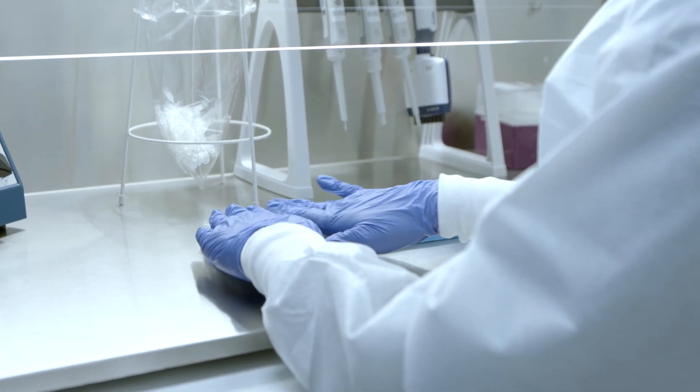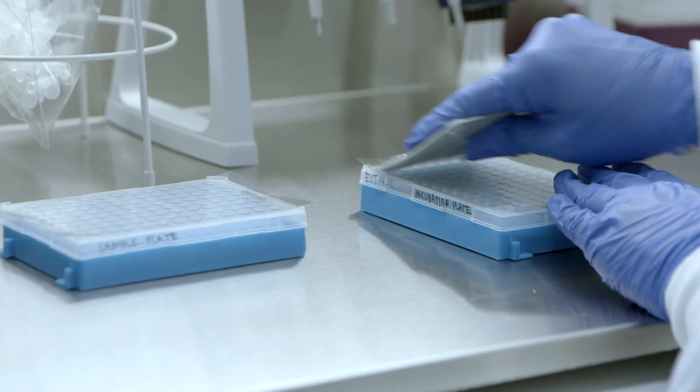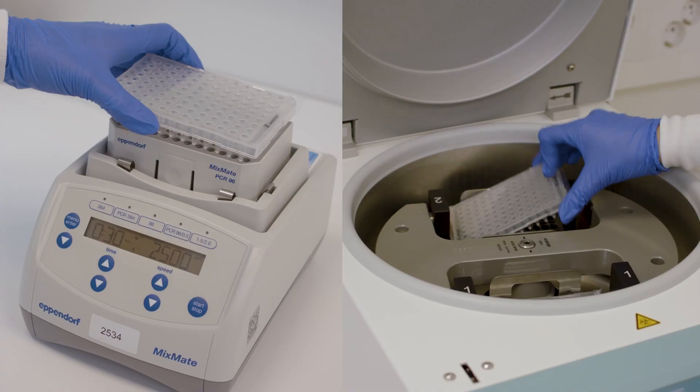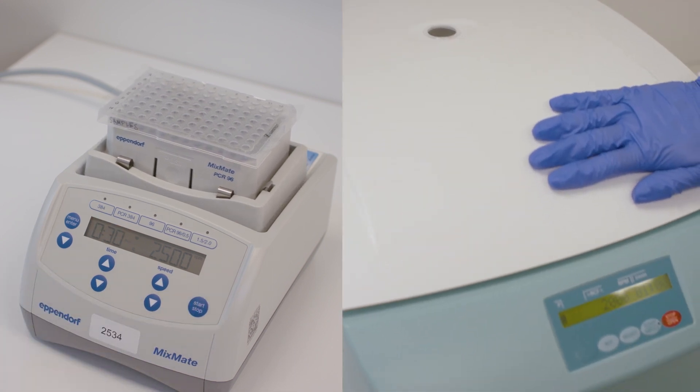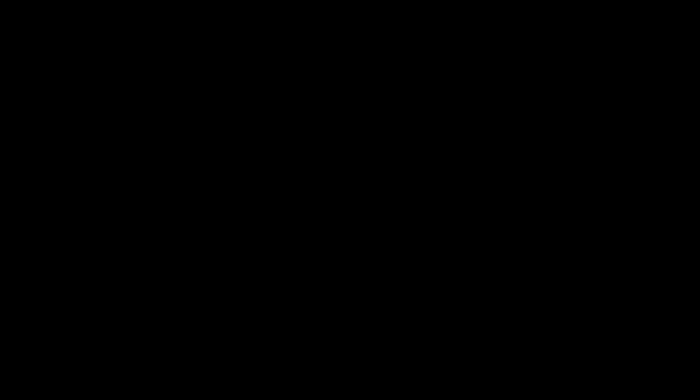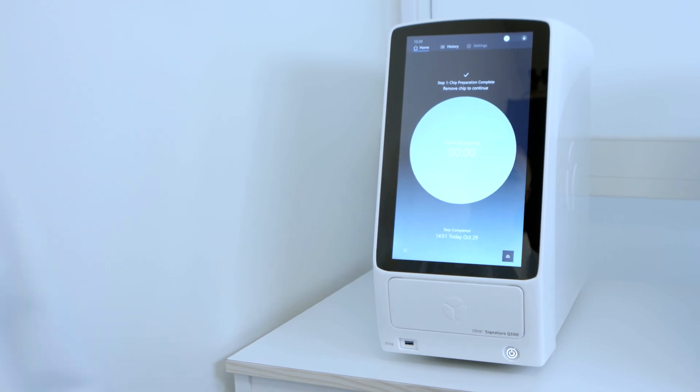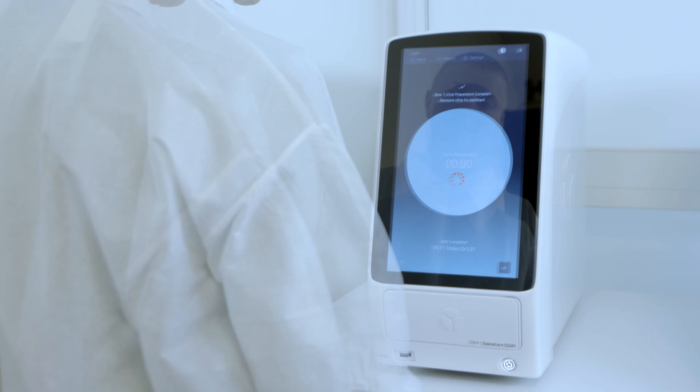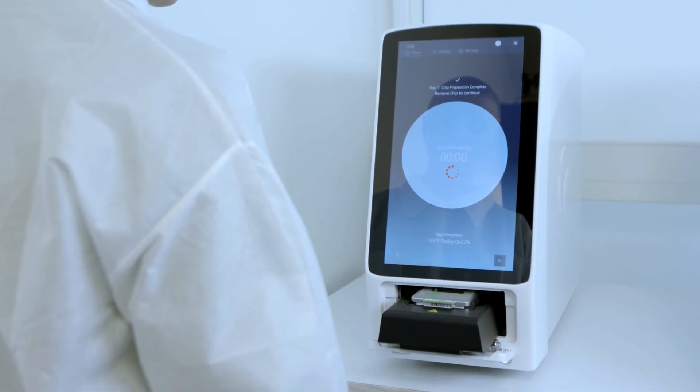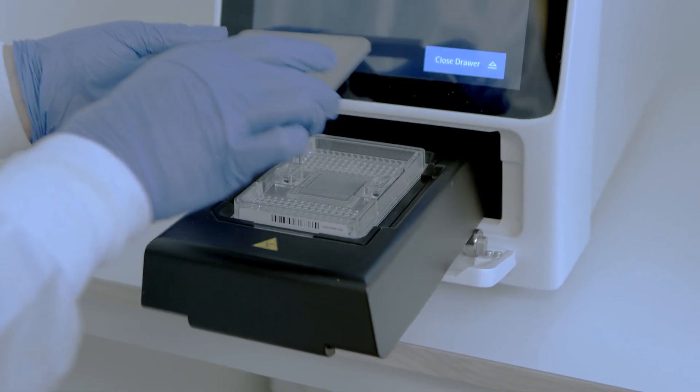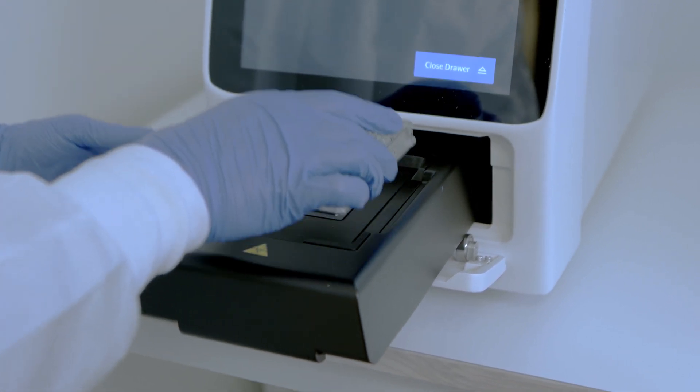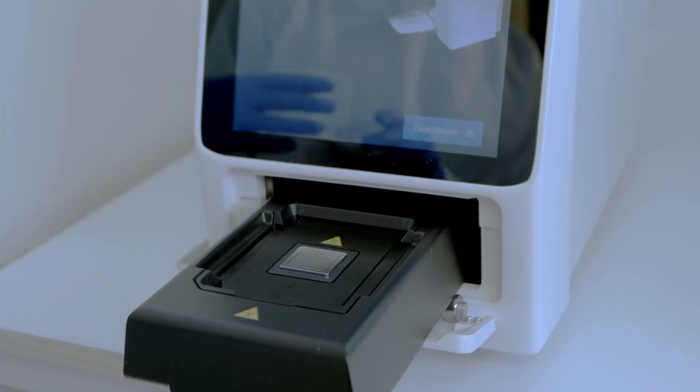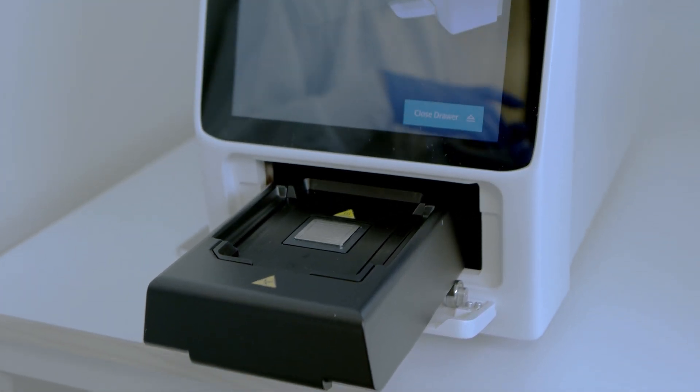Seal both the sample plate and the incubation plate with adhesive plastic film. Vortex and spin down the sample plate before proceeding. The chip preparation is now complete and the chip preparation complete screen is displayed. Tap the eject symbol to open the shuttle drawer and remove the interface plate and the IFC from the instrument. Tap close drawer. The shuttle drawer closes.